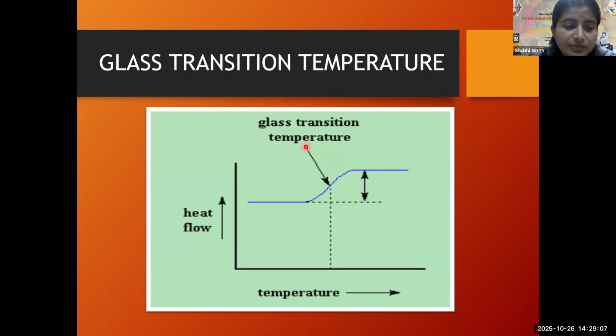food's glass transition temperature. You may also notice that the change doesn't occur suddenly, but takes place over a temperature range. If you are constantly giving higher temperature, the glass transition won't occur suddenly. It will occur after a certain period of time. Because it occurs over a temperature range, picking one discrete Tg is kind of tricky, but we usually just take the middle of the incline as Tg.